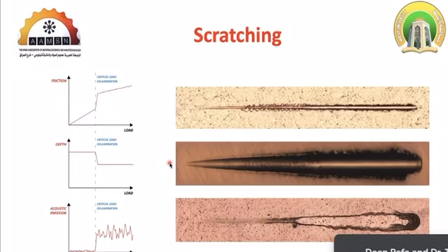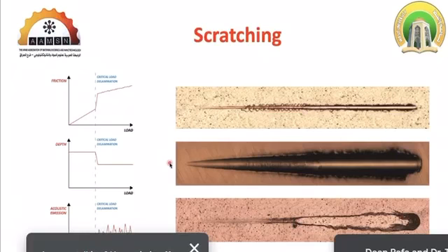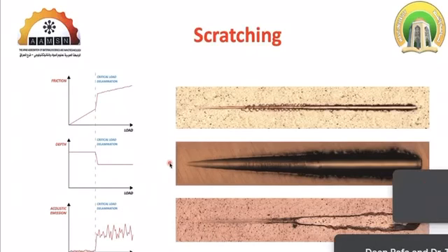يعني هو احنا البرزنتيشن كان على التكنيك without concerning about the material. احنا الماتيريال اي ماتيريال نقدر نفحصها بهذا التكنيك. يعني اي ماتيريال اي كوتنج، اي سيرفيس تريتد ماتيريال نقدر نستخدم التكنيك حتى نسوي كاركترايزيشن للسيرفيس. اي سيرفيس، حتى البولك سيرفيسز. هسه كان اكو فد ديبيت بالساينتفك كوميونتي حول هل النانو كاركترايزيشن of the material represents the micro characterization of the material، وهذا الحل من فتره طويله، وفعلا وجدوا انه هذا النانو كاركترايزيشن gives even more accurate results. يعني الريزلتس اللي جايه تطلع عندي بالنانو سكيل هي اضبط، no error if the experiment set correctly there is no error.